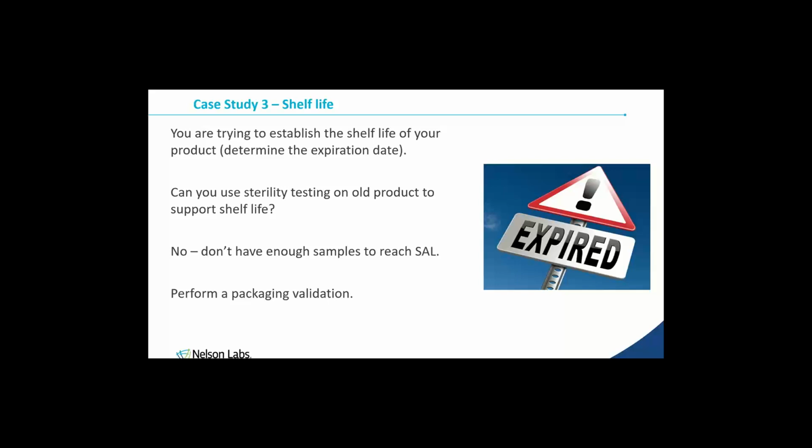You take the 2-year-old product and perform another time point of that packaging validation, where you would run a strength, an integrity, microbial barrier test on it, and show that all those properties are the same. Again, those are physical tests showing that even now that it's a year older, those materials and those seals and the package are all just as good at being a sterile barrier as they were at the 1-year time point that you've previously done.